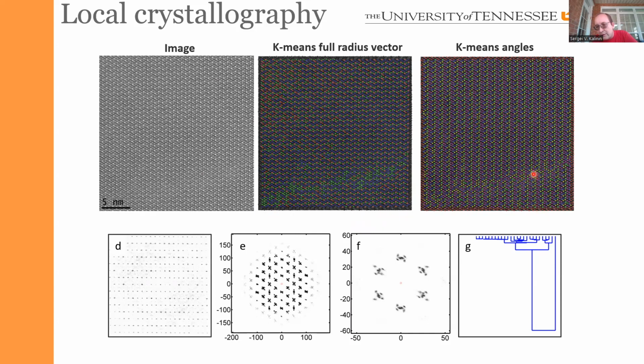Then you see that here, these columns are shifted by half of the period. I mean, perhaps it is possible to deduce this behavior by looking at this image only, but we realized that it happened only based on this analysis.